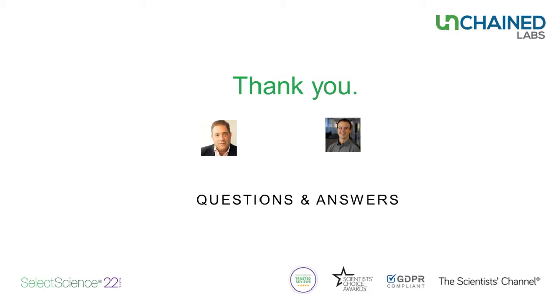Yeah, so for 21 CFR Part 11 software, yes, it does. So if you have a GMP or GLP lab and you need to lock down data integrity, then yeah, it's just a software add-on that we make available.